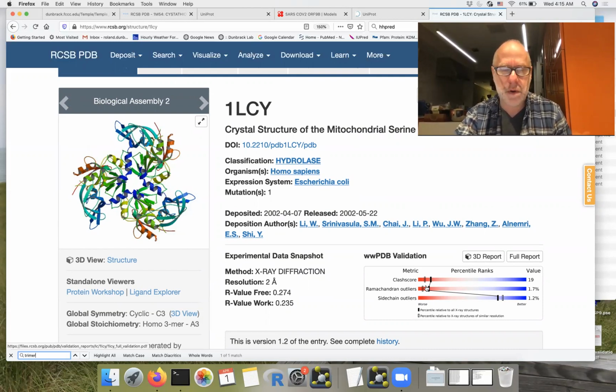I think that's better now. I'm on the PDB's advisory board, so I get to request that they change things. And so now they show authors the different PISA biological assemblies and say to them, pick one of these, unless you think it's something else, and then give us the coordinates for that. But otherwise, here's a picture of it. Oh, and most authors will say, oh, there's the trimer. Yeah, I'll pick that one.